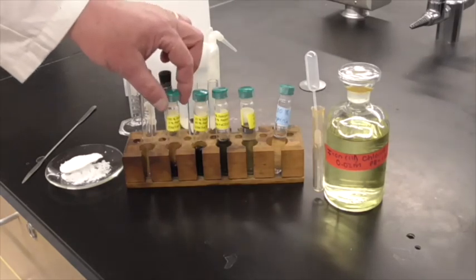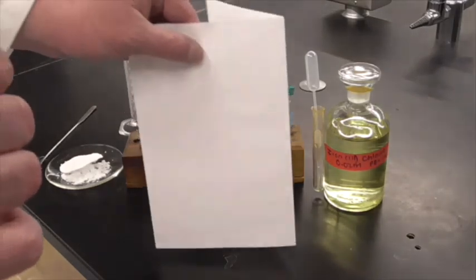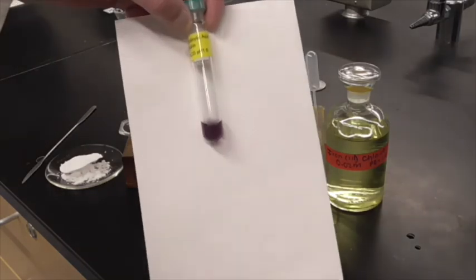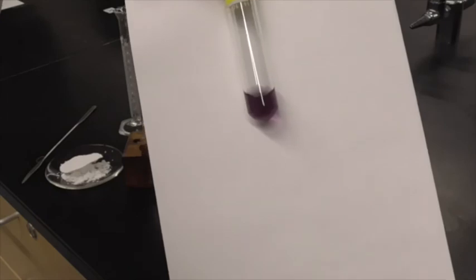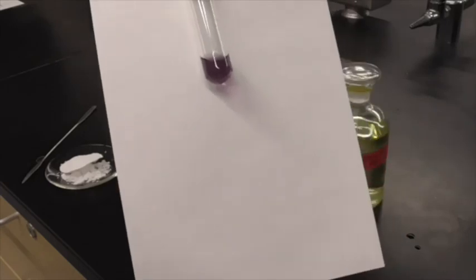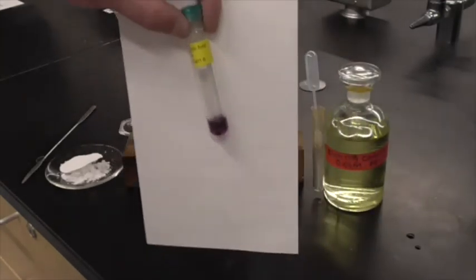So if we just take some of our salicylic acid, some of that white powder that we started our reaction with, and mix some iron 3 in with it, you can see it's a violet colored solution. So if I don't have any aspirin and it's all salicylic acid still, I get that medium dark violet solution.